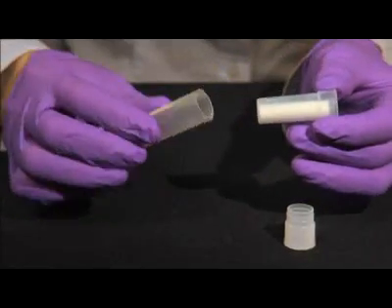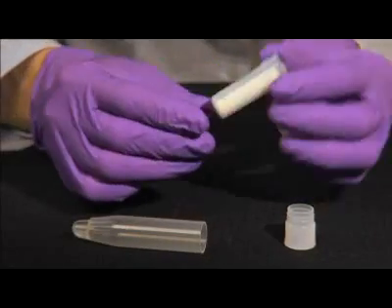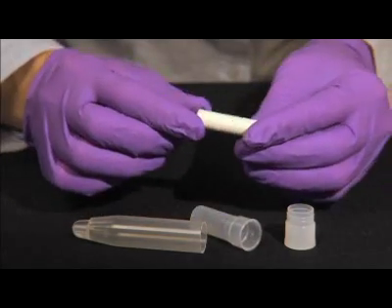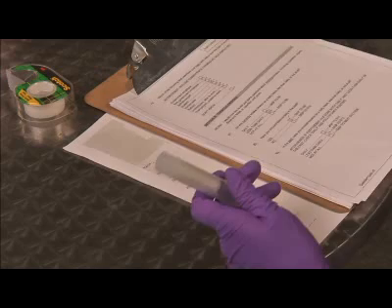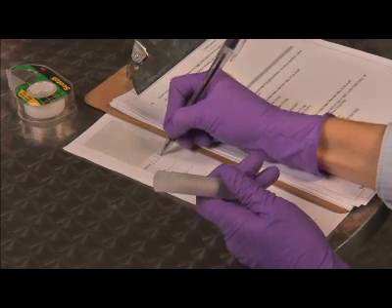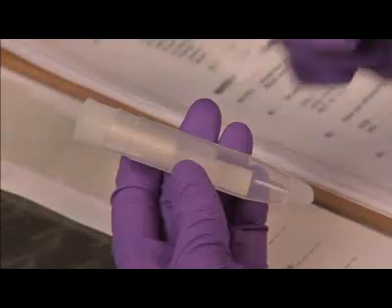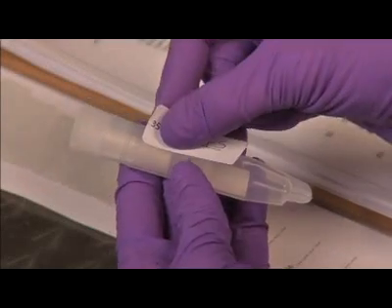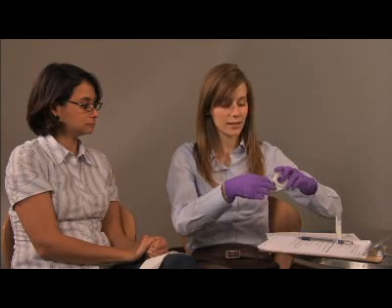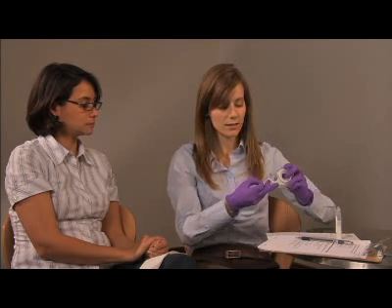This is a salivette. It is basically made of 3 components: the inner tube, cotton roll, and the centrifuge tube. It's best to label the tube with the participant's study number before collecting the sample. Write the number on a weatherproof label and adhere it to the tube. Adding a piece of tape can help keep the label on once in the freezer.